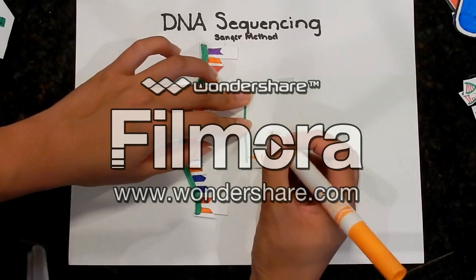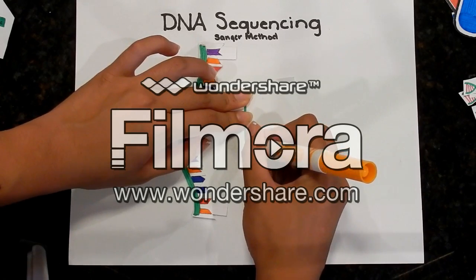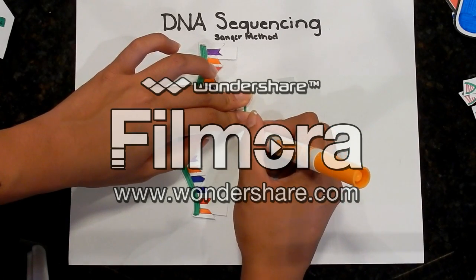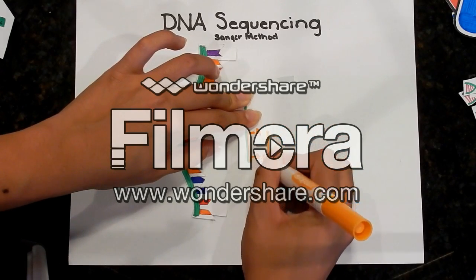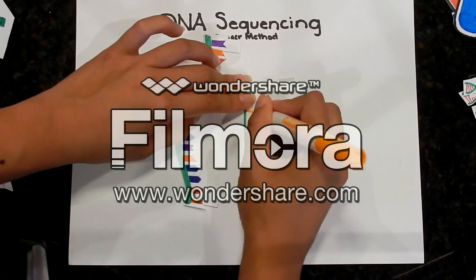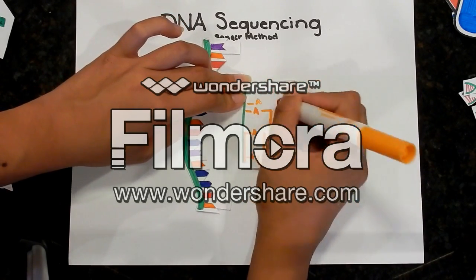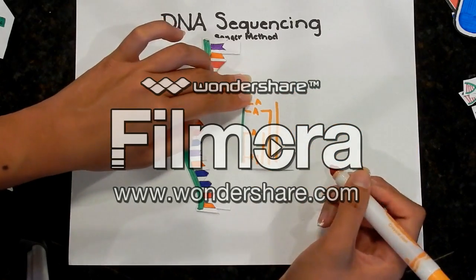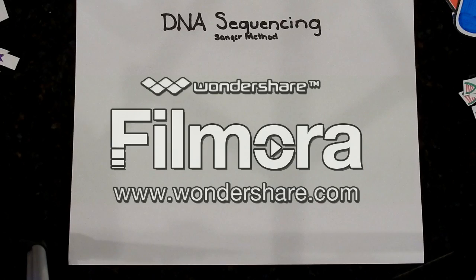And say it makes another copy of DNA to complement it, but then it stops only here because that's where the next adenine dideoxynucleotide stops. And it keeps going down the chain depending on where the next adenine nucleotide is. So we will have different lengths of DNA fragments produced.